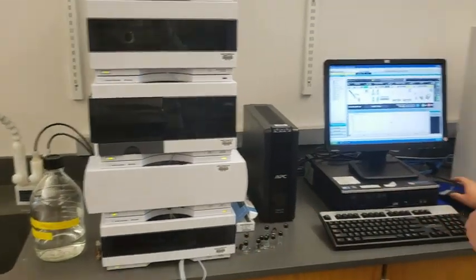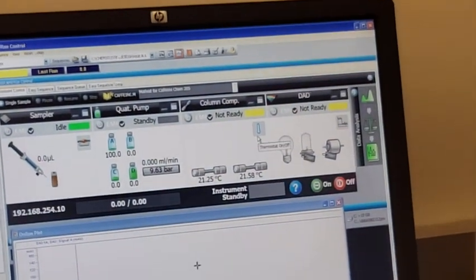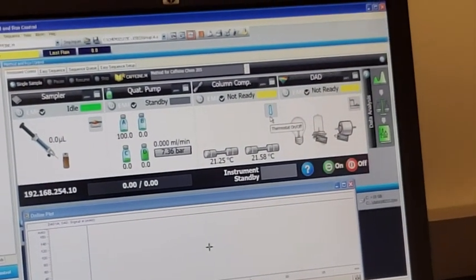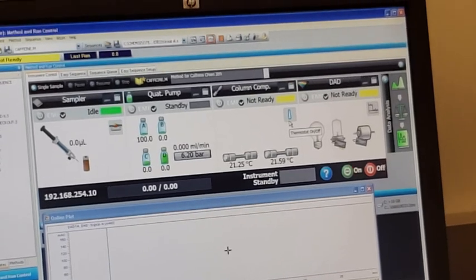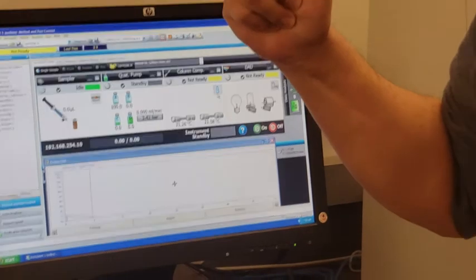But down, up, hit every button. Come over here, hit the X button. Don't save it. I don't believe you save anything to the method. Make sure you edit it every time. And that's it. That is how you run your sequence and work on the program for HPLC.